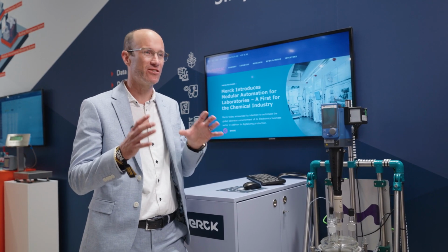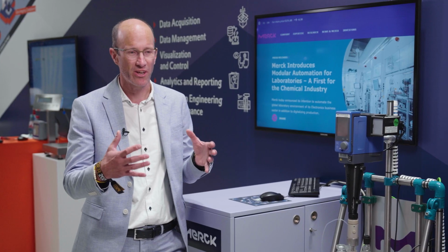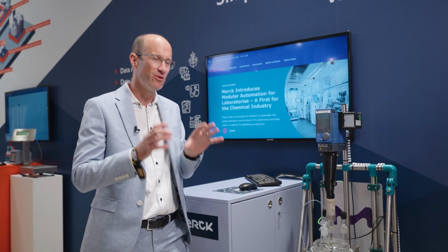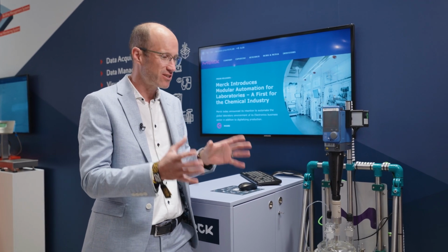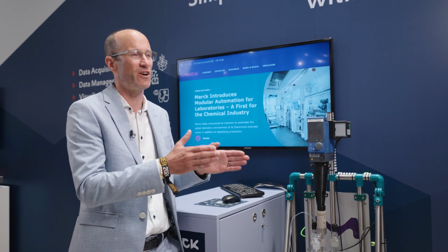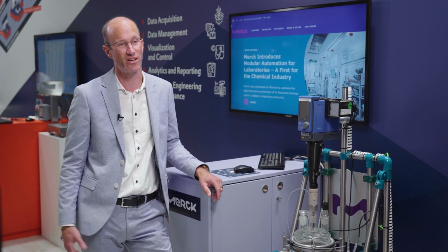The really cool message is that you have one platform behind. The platform itself is not seen directly. The cool thing is you see a lot of different suppliers on this booth using this technology to be connected to one system. So you start to be one ecosystem, but each supplier can still offer its functionalities, its IP, its knowledge on its technology. And combined in an overarching process orchestration, this is cool.